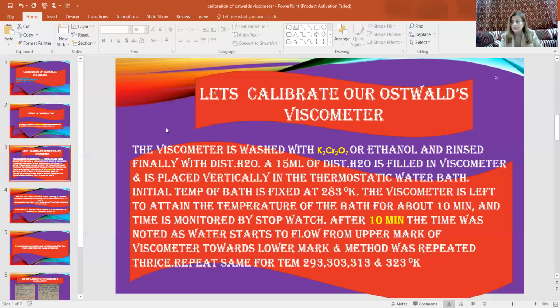So I have used this Gallenkamp viscometric bath by myself at the Institute of Chemistry, University of the Punjab. I've done a lot of measurements there. I've used it in my MPhil and my PhD also. So it's still lying there. If somebody is interested, you can see this instrument there, and you can take my help. I can show you, and I can make you understand how it works, right?